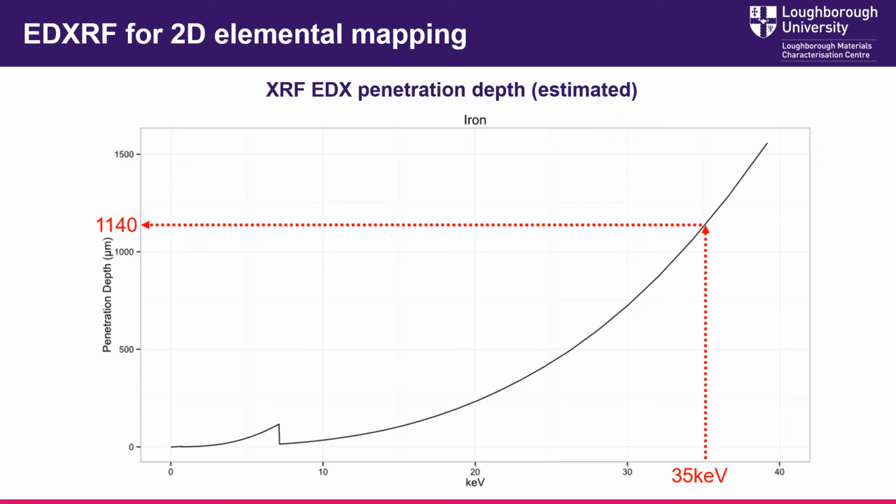To get an appreciation of sample penetration by the X-rays, we can estimate this from the tube energy used and the density of the majority element iron. Because the sample is a steel alloy, it is reasonable to say that penetration is approximately around 1000 microns or 1 millimeter. Therefore, the volume morphology is more detailed and provides better materials characterization data.